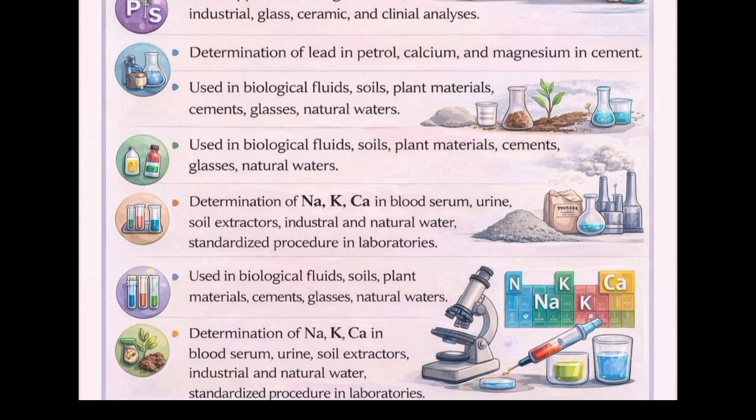The determination of sodium, potassium, and Ca in such diverse samples as blood serum, urine, soil extracts, and industrial and natural water is standard procedure in many laboratories.